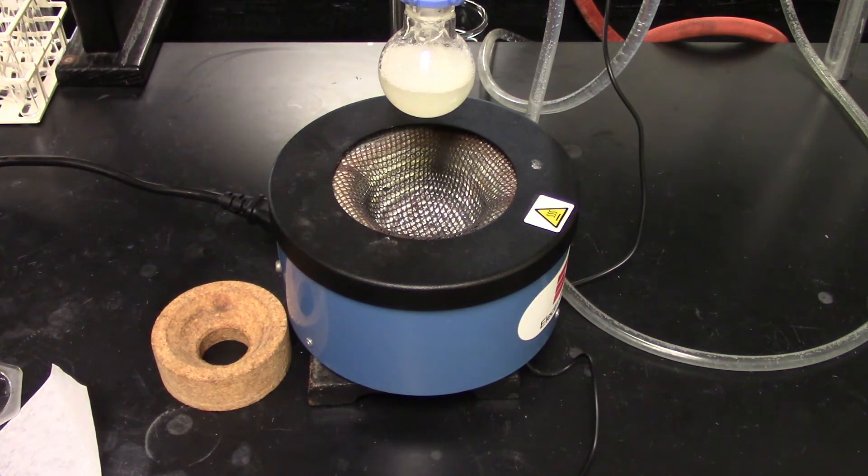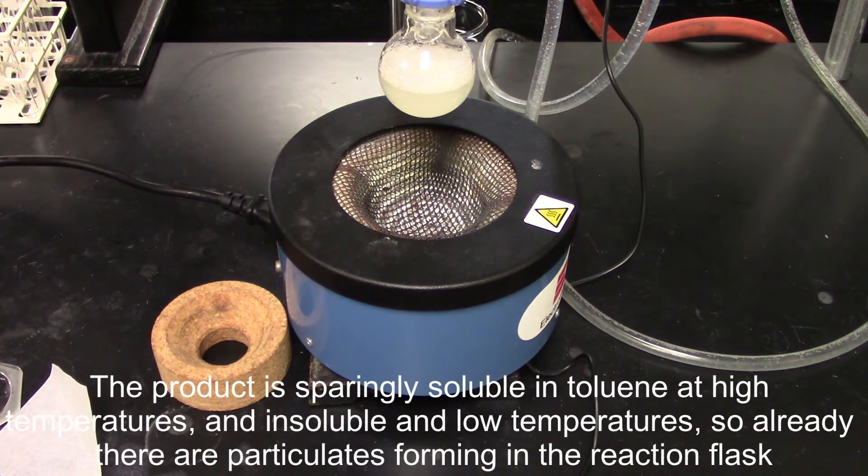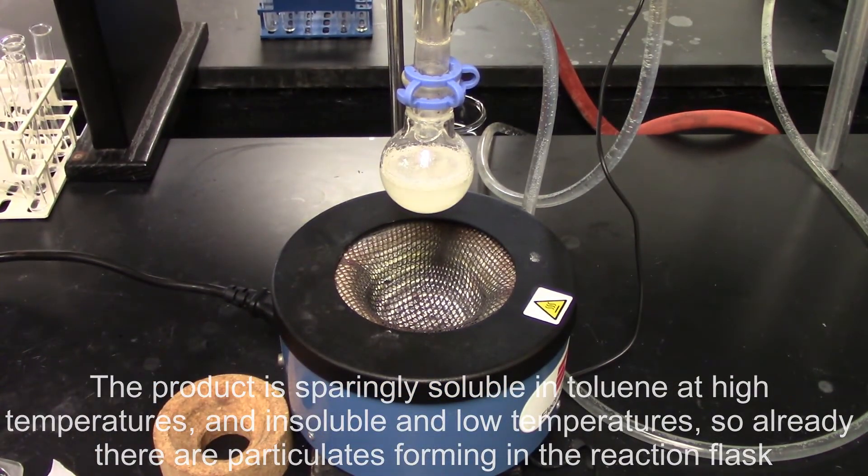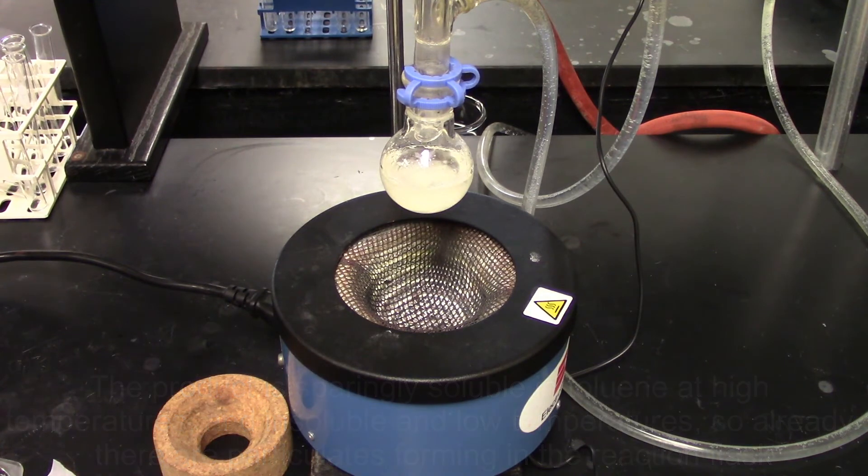Now our final product material is actually sparingly soluble in toluene, so we're already getting this foggy color due to what's starting to come out of solution. But definitely when we drop the temperature, we're going to see a lot more solid start coming out, and that will be our desired product. It's just not very soluble in toluene, so this makes this isolation pretty easy.